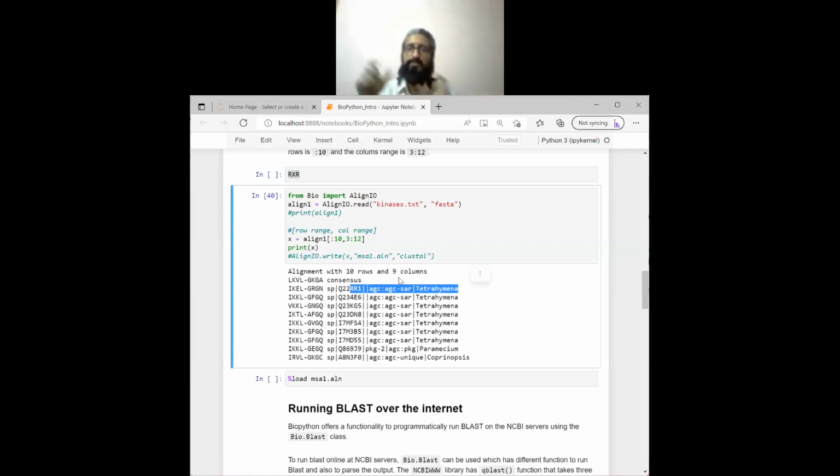For example, if in one sequence you know that from residue number 509 to 515 that motif is, you note it down and specify it in the slice, because you need some information about what chunk you want to take. So it's just for slicing and not for searching. Yes, absolutely correct.